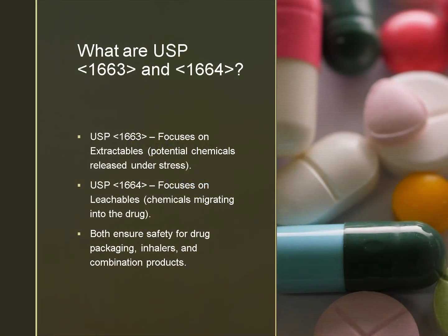Let's break it down. USP 1663 focuses on extractables. These are the potential chemicals that could come out of a material when it's pushed to its limits. Think of it like a stress test. High heat, strong solvents, pressure, to see what might leach out under extreme conditions.